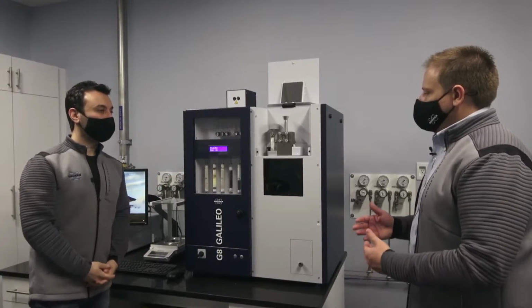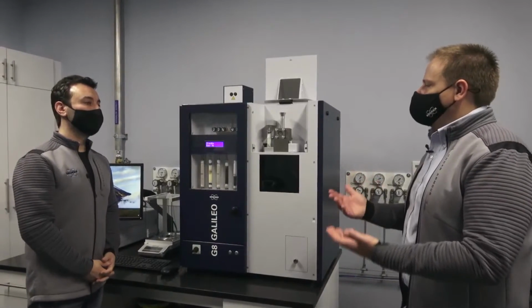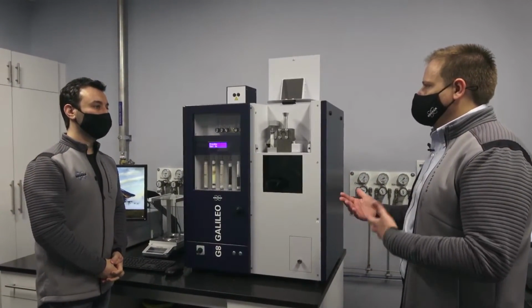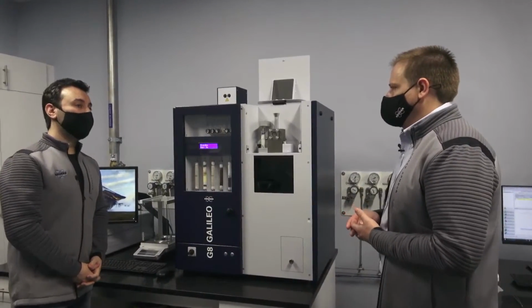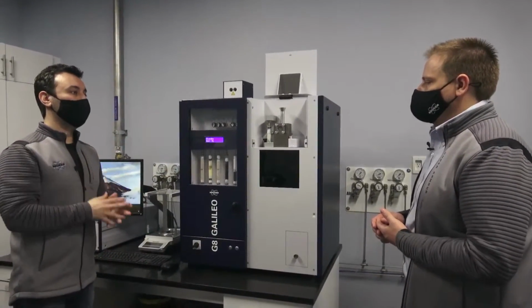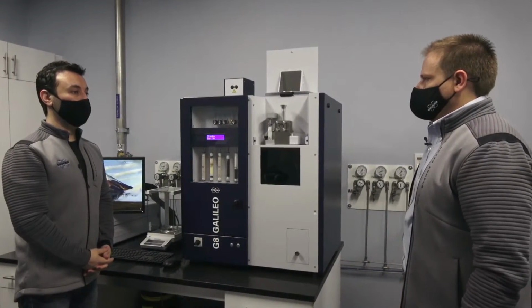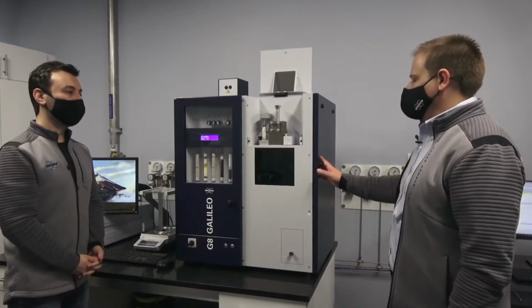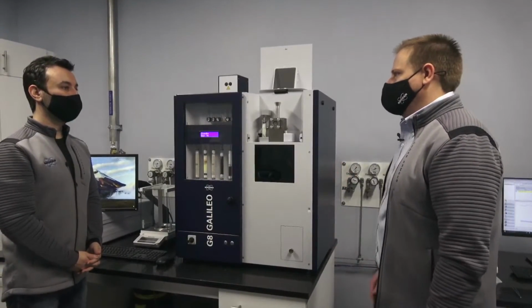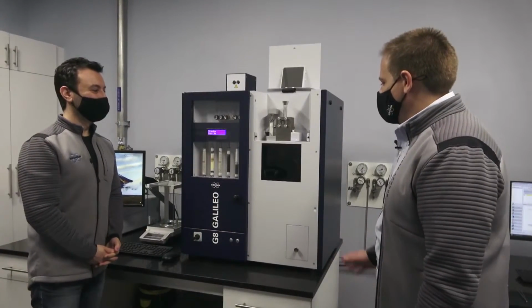And I've heard that that's actually one of the environmental factors: can we reuse the powder of additive manufacturing? And a lot of that concern is the argon inclusion that you mentioned, right? Yeah, that's what they do. They reuse it, but that also changes the oxygen content, for example. And that's one of the main applications for fusion. Really? So this is supporting that coming industry that we all know is going to take over a lot of manufacturing, right?